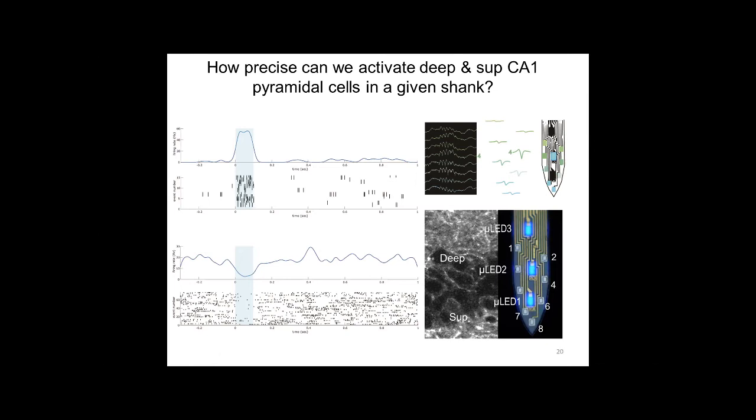So to evaluate these types of changes, we can estimate a firing rate gain by z-scoring the basal firing rate of the cell, and then we can evaluate whether the response was increased, therefore an excitatory response increasing firing, or decreasing firing, and somehow suppressing firing here.